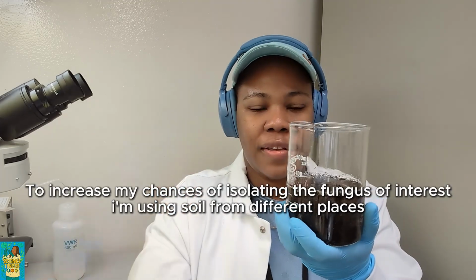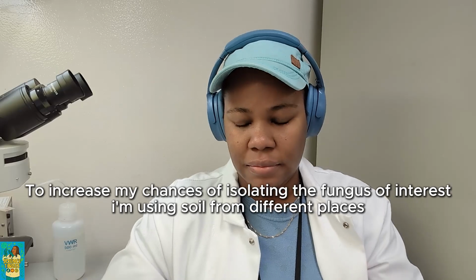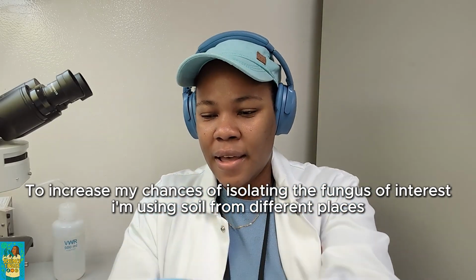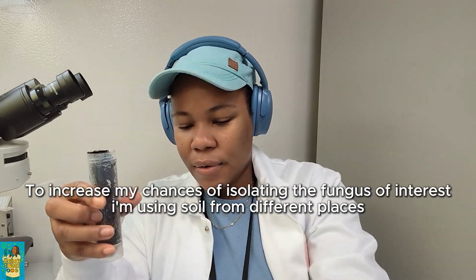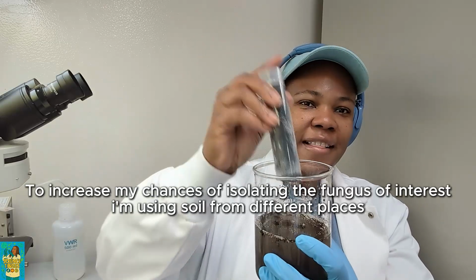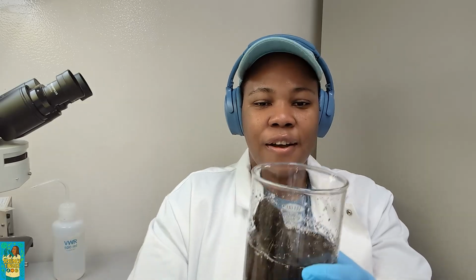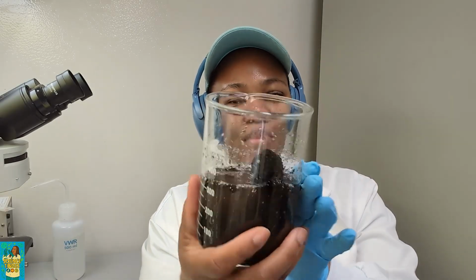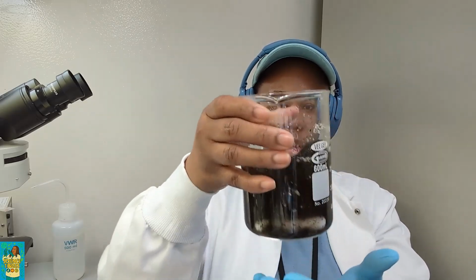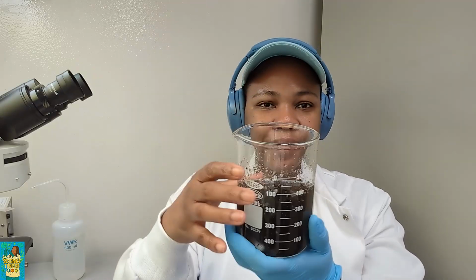This is just potting soil, like you can buy from the garden store, Home Depot, or Canadian Tire, I don't know. And this is the one I got from the river. All right, I need help with this one. Oops. Oh, it took the shape of the falcon tube. I have the stir bar in it, so I'll just put it on a magnetic stir and then this will spin.